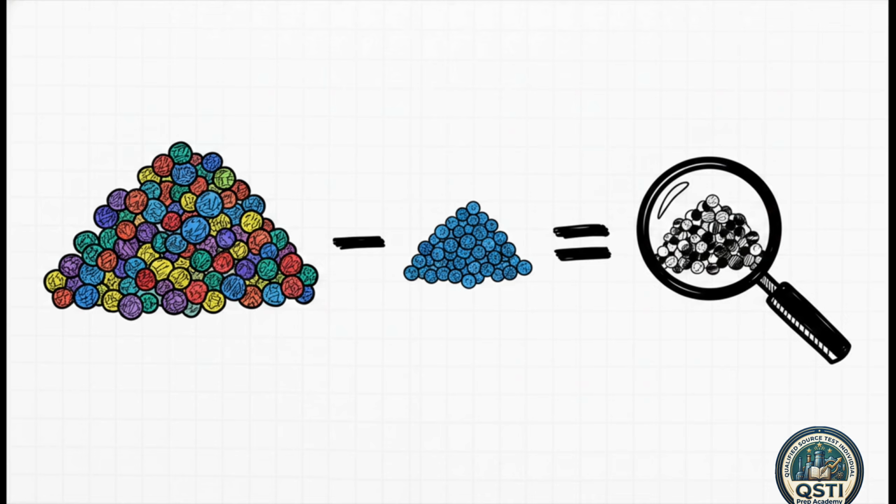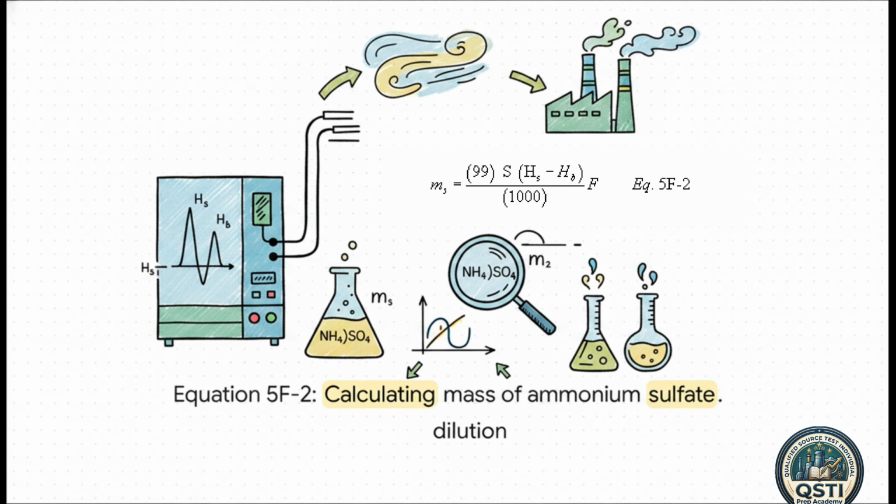If you take the total particulate weight that we dried and weighed earlier, and you simply subtract the sulfate weight, which we calculated as ammonium sulfate, what you are left with is the non-sulfate particulate weight. That is literally it. Total minus sulfates equals non-sulfates. And this brilliantly illustrates how the EPA translates that simple logic into some pretty rigorous mathematics.